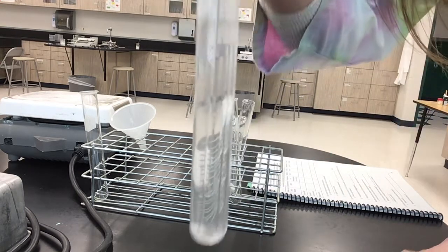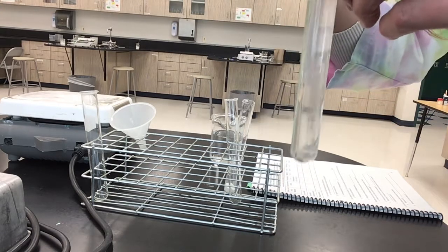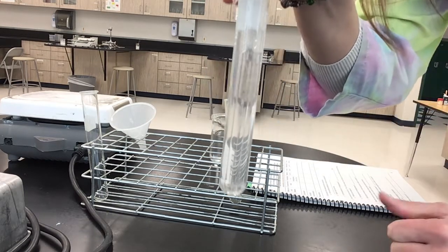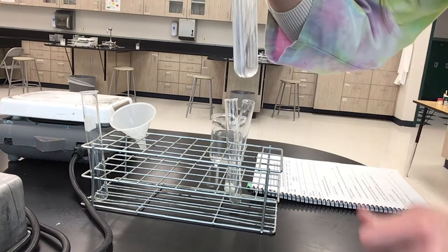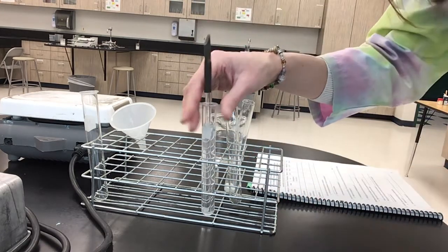And you can see it's pretty see-through at this point. So I think it's clear. The rest of this will dissolve in a moment. So because we can see through it, it does not scatter light. And our type of mixture right here, hopefully you can see, right, is a solution. So there's alum and water.